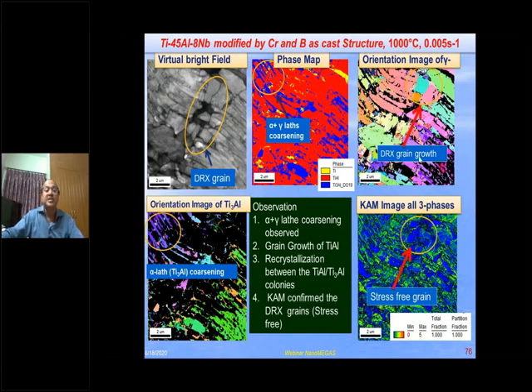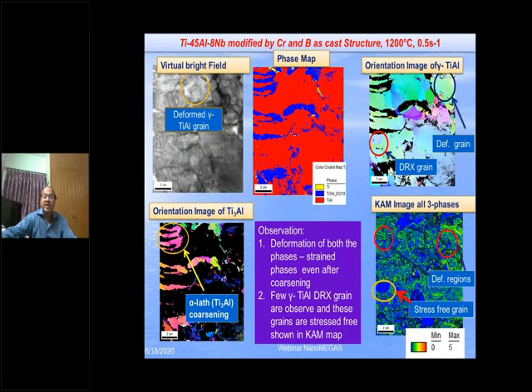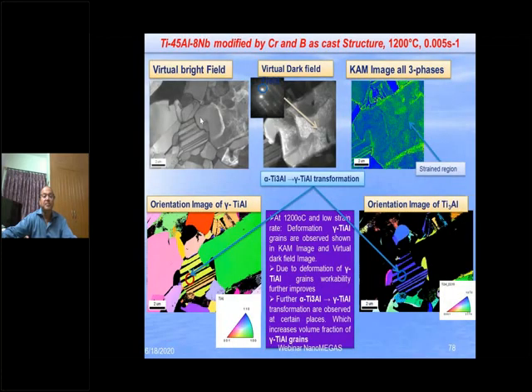One of these is ACOM and PED. Combining these two, we are able to find the structures, even the stresses, the distribution, the phases. These have all been characterized thoroughly using this particular technique and these machines. So we are using this. Look at this particular three-phase structure, this very strained region. We did these thorough studies at various temperatures. I'm not going into the details of all these studies, because I'm just going to give you the application part of it. Otherwise, this itself can be a lecture.